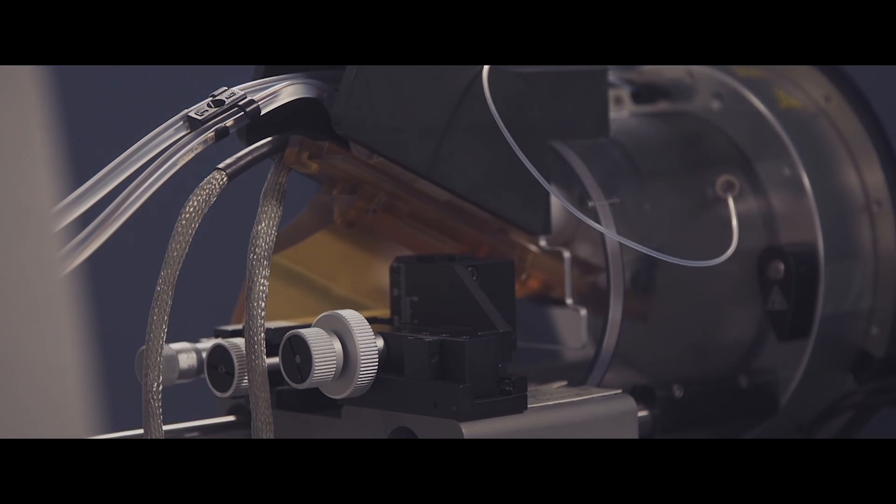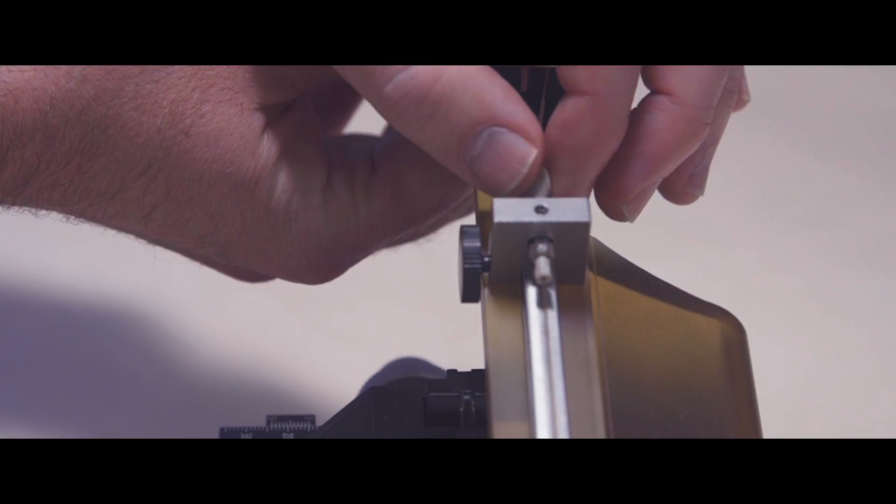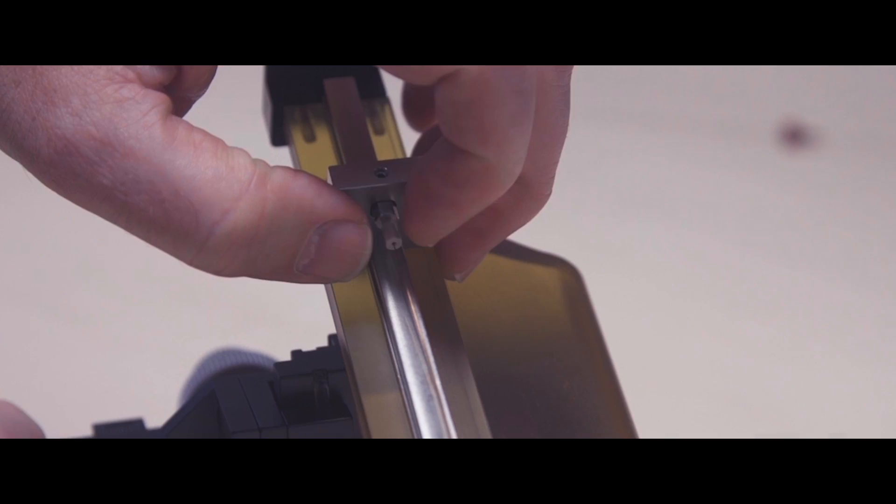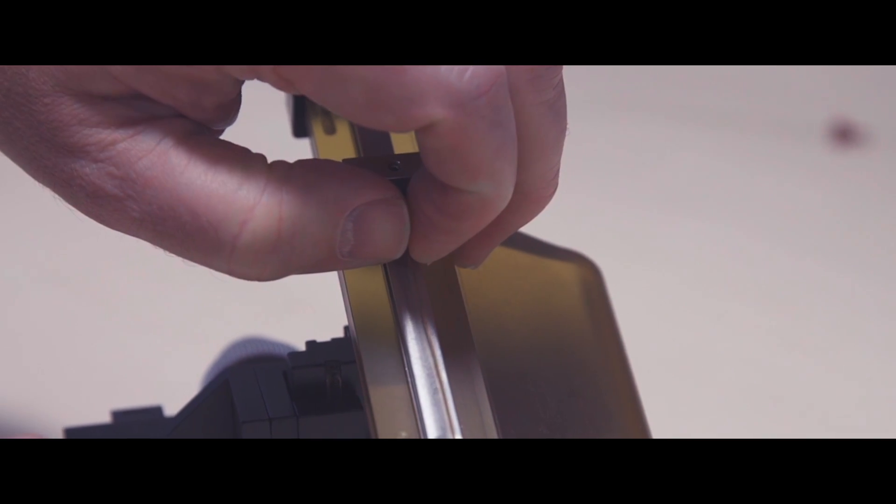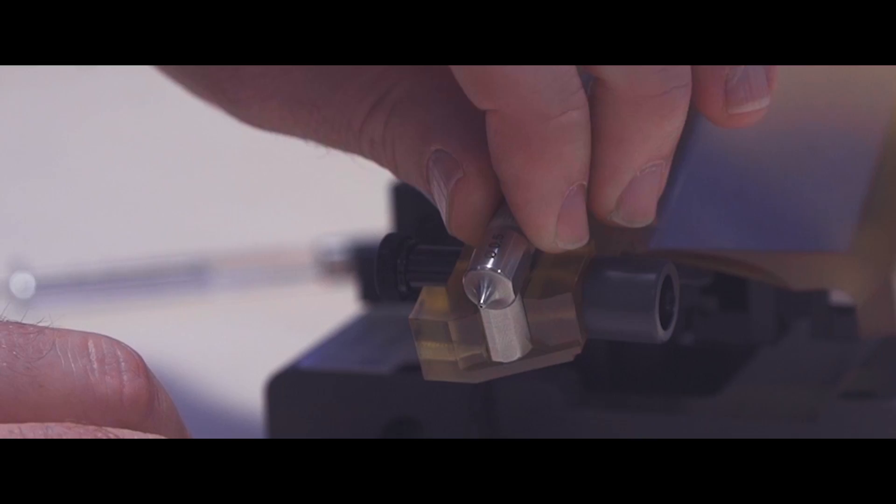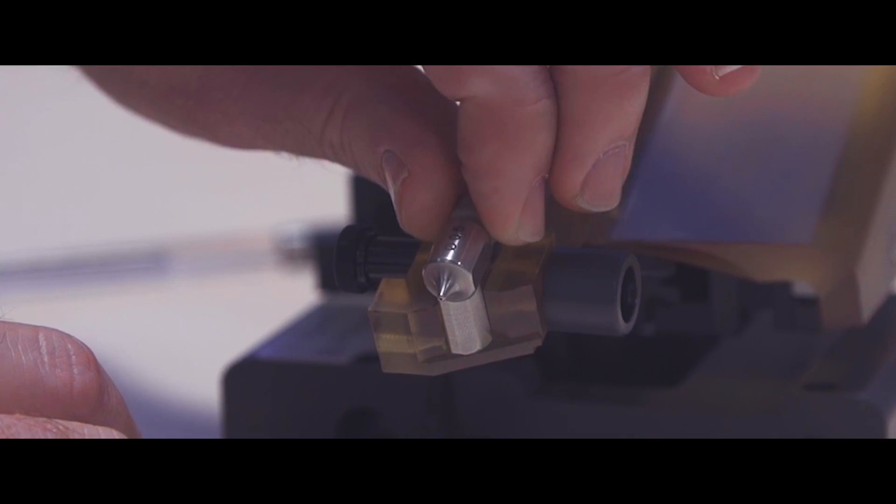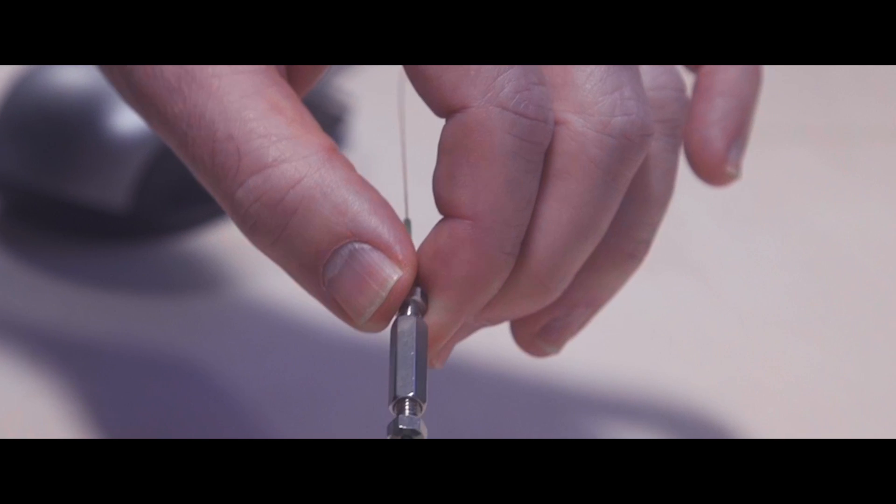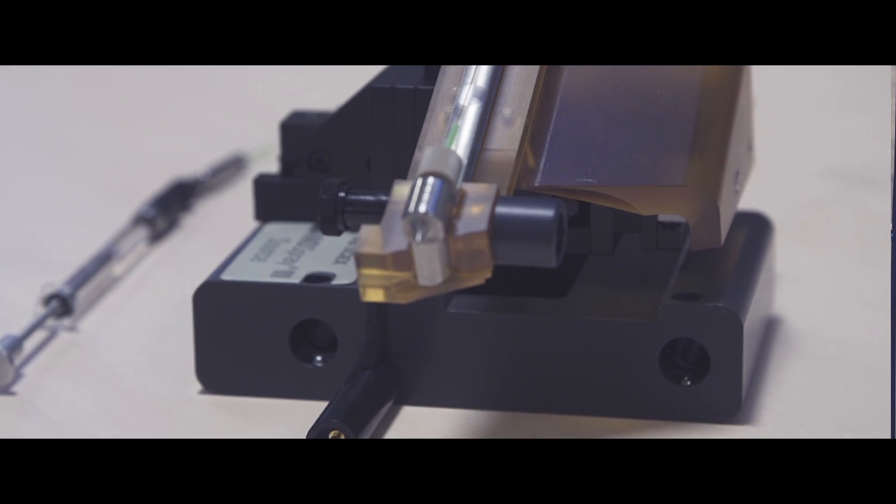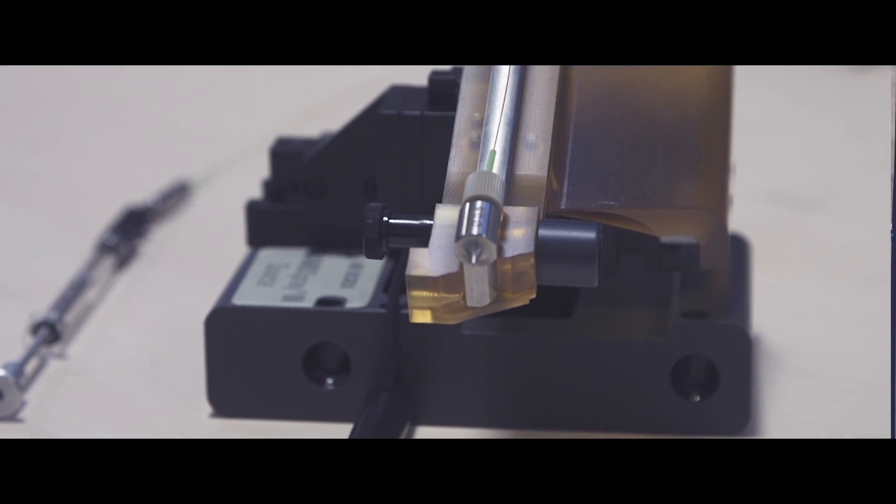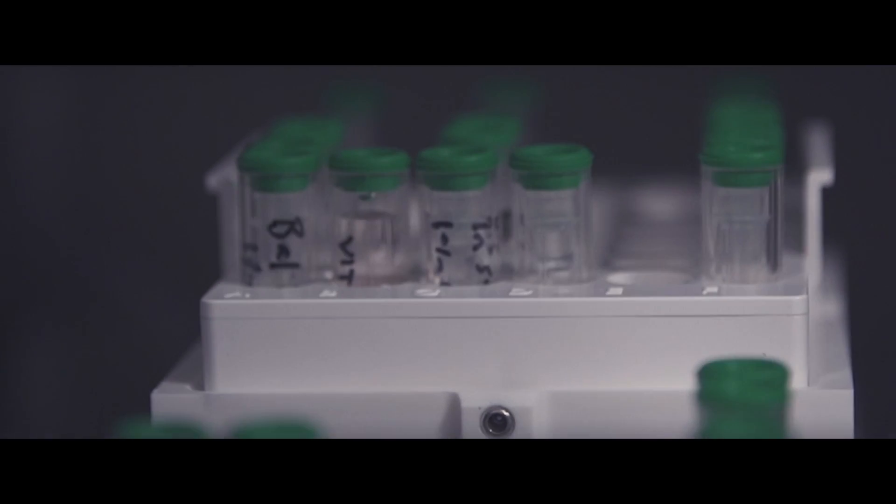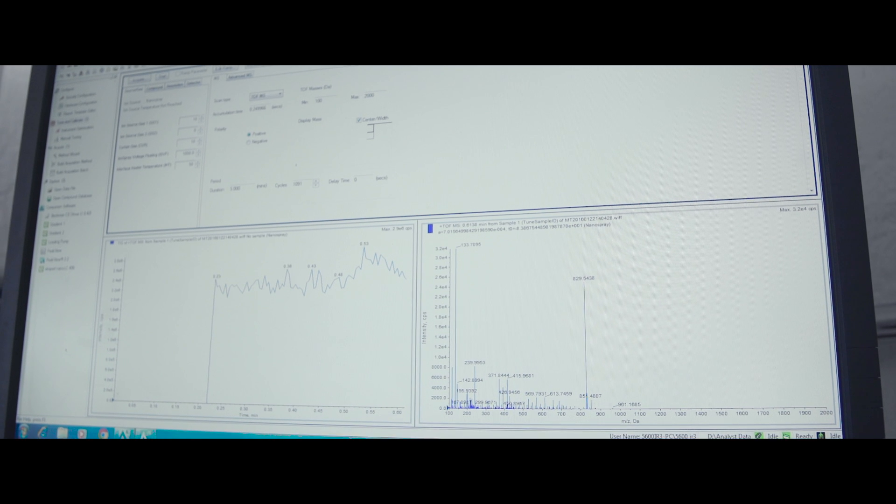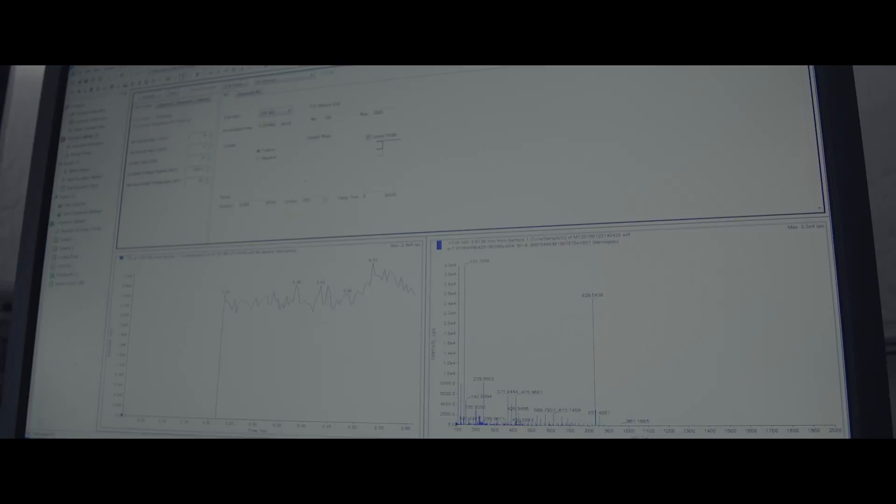When you connect nano LC to a mass spectrometer you have to physically connect the tubing coming from your LC column sprayer tip. This means you have to really eliminate dead volume because the flow rates you're using will really complicate and affect your chromatography.